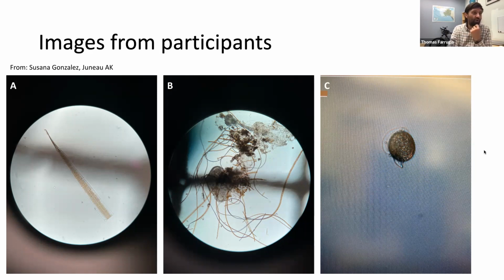If you're able to take pictures under the microscope, that's fantastic. Especially, as we're talking about orientation, if you're able to take multiple pictures as the cells move around to see them in different orientations, that's very helpful. But this is by no means easy. One of the takeaways of this workshop is that we need eyes on the water, but don't feel like you should be expected to know exactly what you're looking at as soon as you look at it.